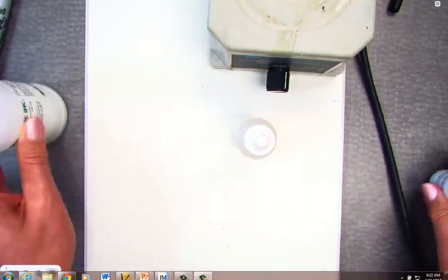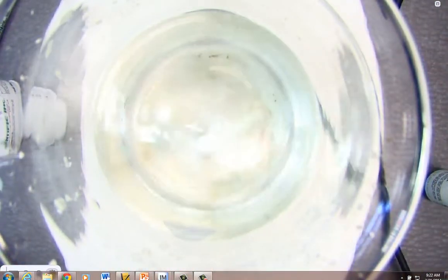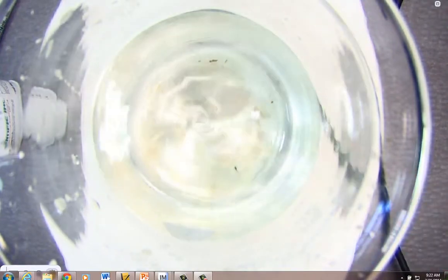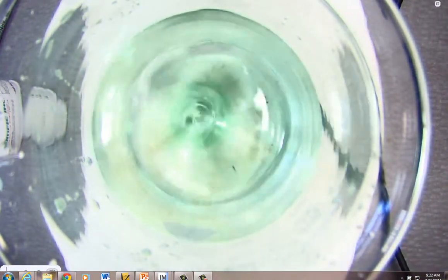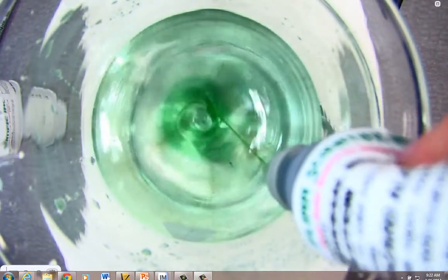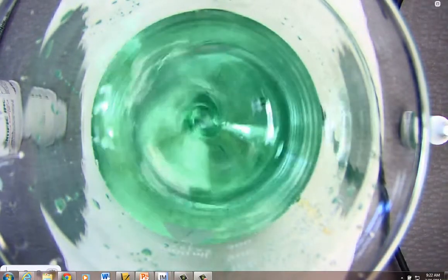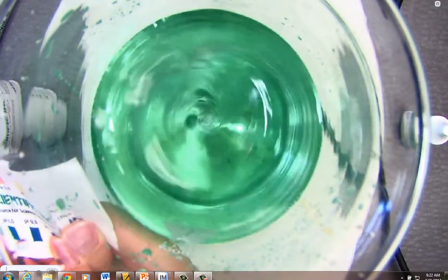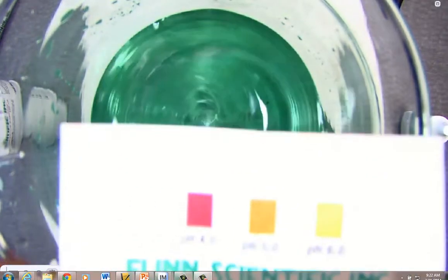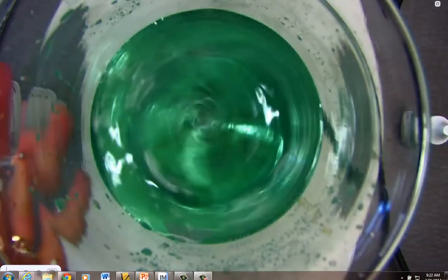Let's begin. I have a magnetic stirrer, and I'm simply going to place some water on it and get it going. I will add some universal indicator to get the color into the water — I'll keep adding until we get a nice green color. Notice, just to remind ourselves, the green on our indicator is representing a pH of 7. Of course, water being neutral — pH of 7 is green, and that's what water would be.